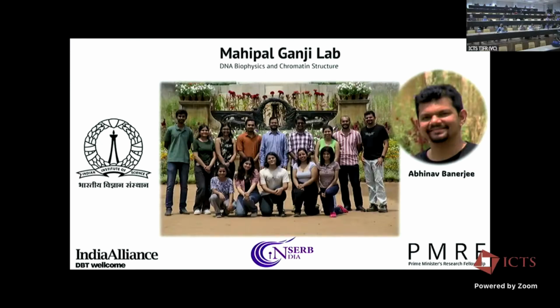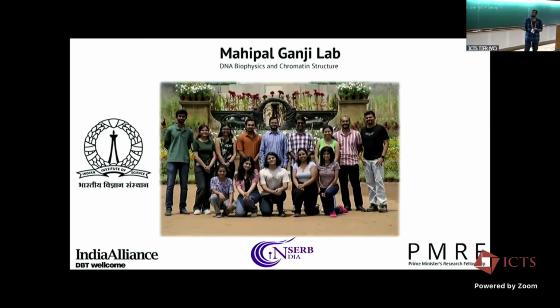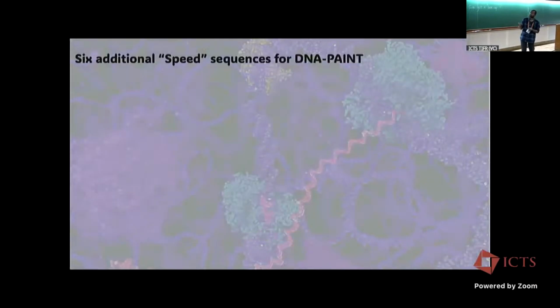These are pixels. And your speckled image, I mean, there seems to be some more structure in it. If you just look at the speckle in the wild type cell? Yes, those are very heterogeneous structures. There is not a uniform structure. Each speckle has its own shape. Some are long, some are round, but they are mostly amorphous. None of them are actually circular, as we see in this particular case over here.